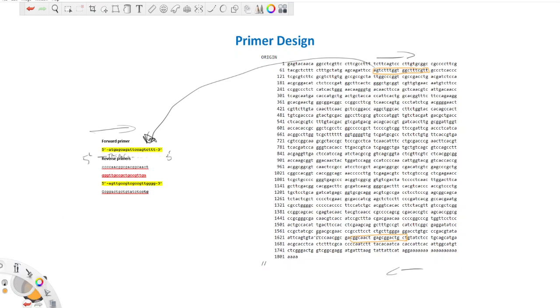So we have a couple of CCC. I actually took this entire region here, which is technically a little bit way more than what I was supposed to take, but I'm just showing you as an example. Please make sure that when you select yours, you get until the end there. As you can see, there are 4 cytosines, and I stopped. Let's look at it again quickly. 4 cytosines, and I actually stopped somewhere before there. So we're going to reselect that again.